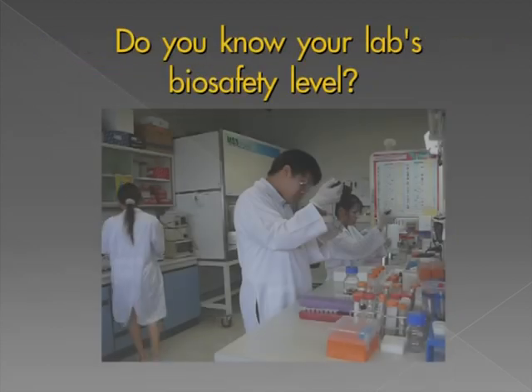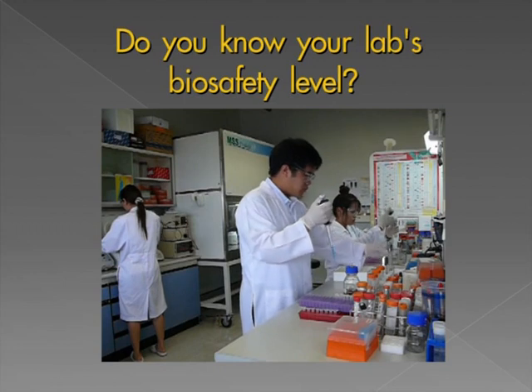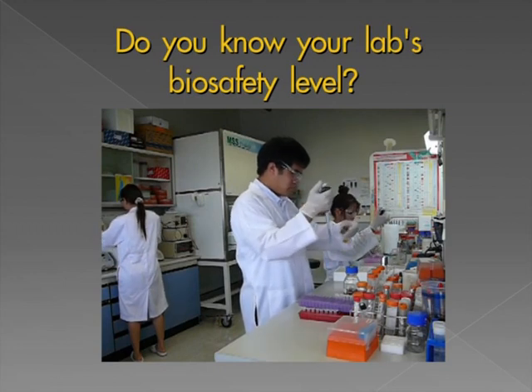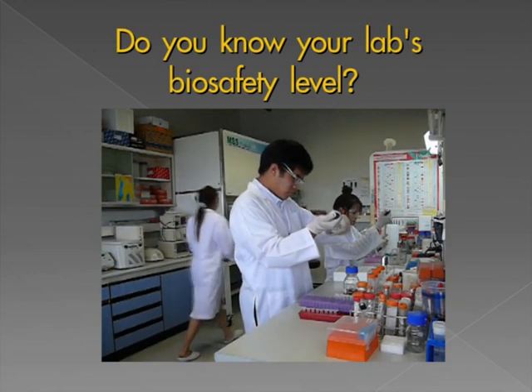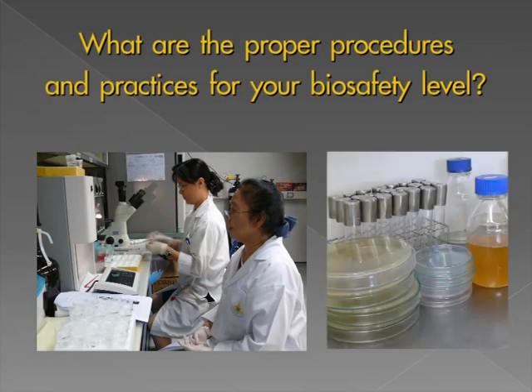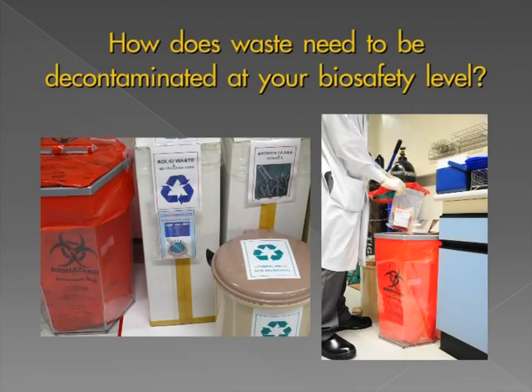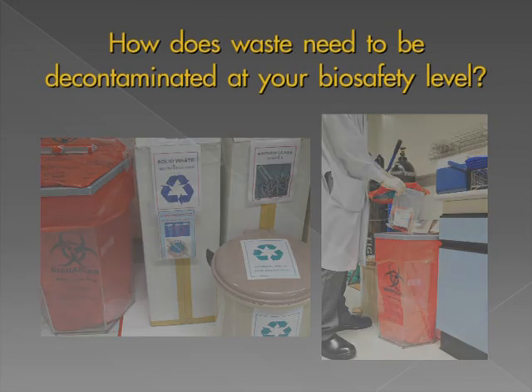Do you know your lab's biosafety level? What are the proper procedures and practices for your biosafety level? How does waste need to be decontaminated at your biosafety level?